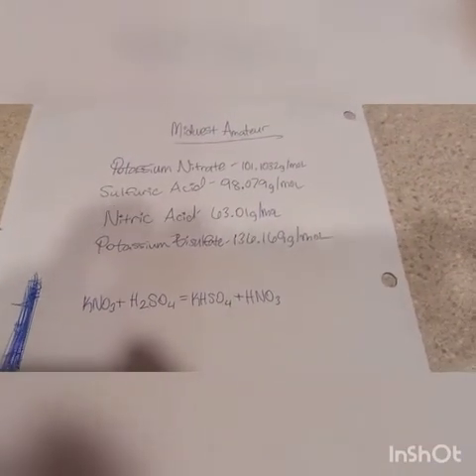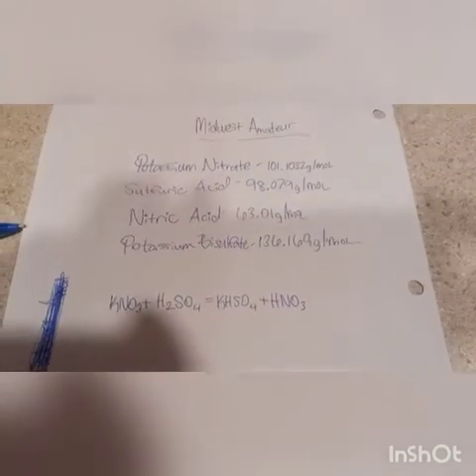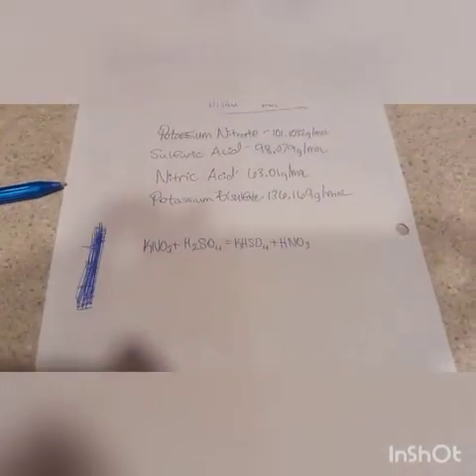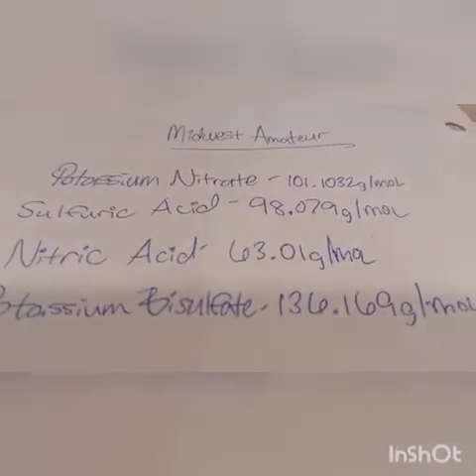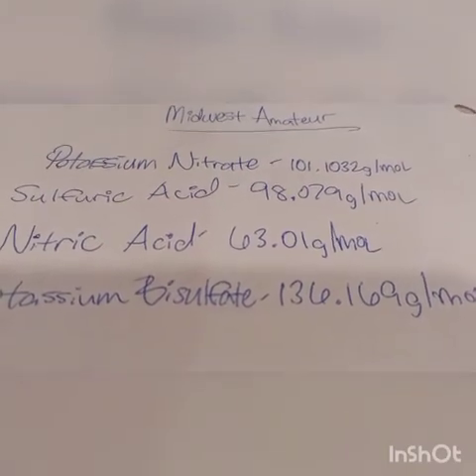We're doing everything on a 1 molar scale. This makes the math pretty easy and quite lazy for me, as all we have to do is go to Google and look up the molar masses. I've been the lazy chemist when it comes to math lately, so here we go. Potassium nitrate, we're going to start off with 101.1032 grams. I'm going to go ahead and round that to 101.1. So we started with that and loaded it into a 500 milliliter flask. Probably didn't need that big, but it's the smallest round bottom I got right now.